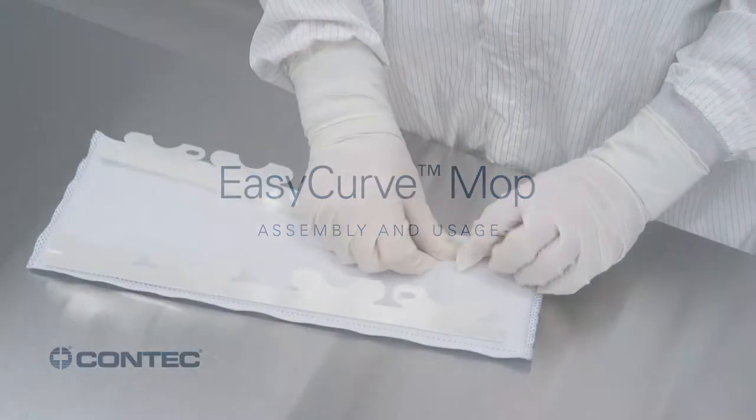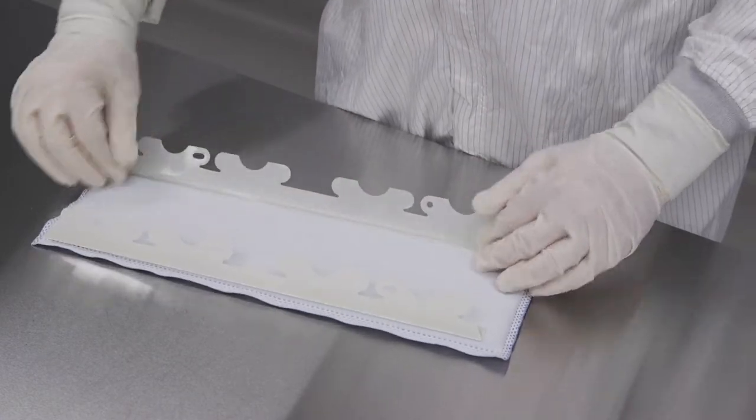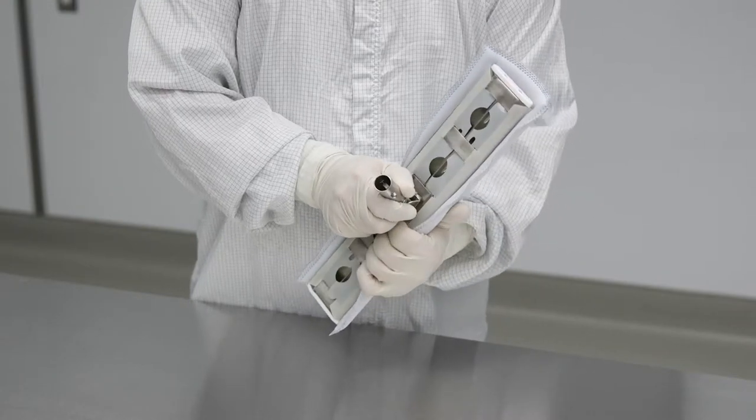To assemble the EasyCurve mop, first fold both sides of the polyester flaps along the perforated lines of the mop head. Align the mop head with the frame and push all the tabs into the slots of the frame.